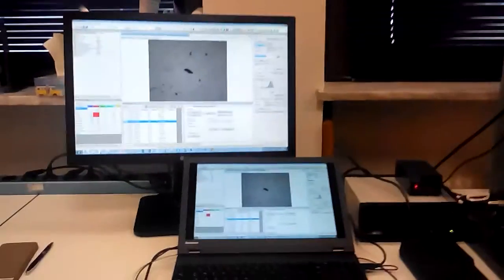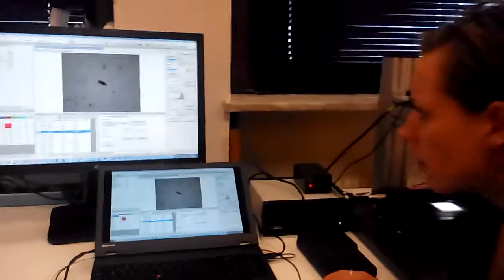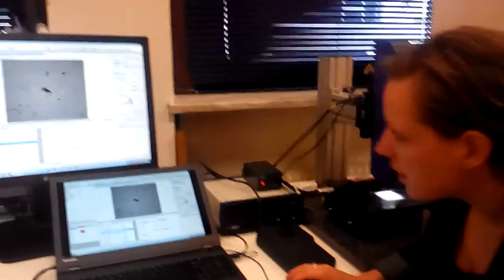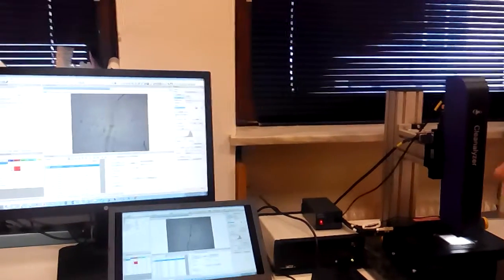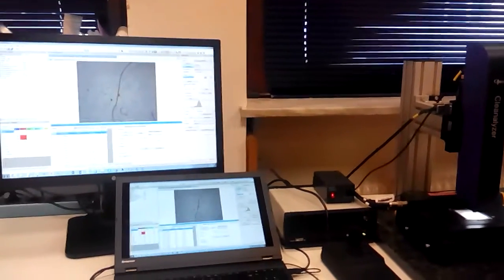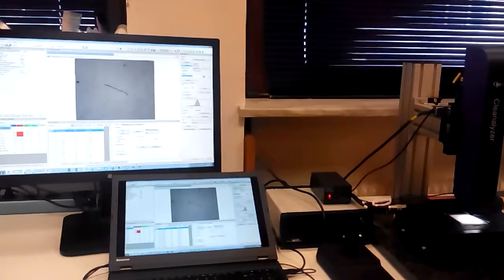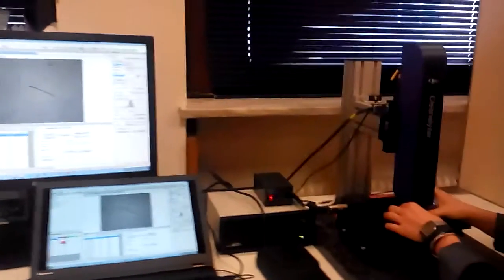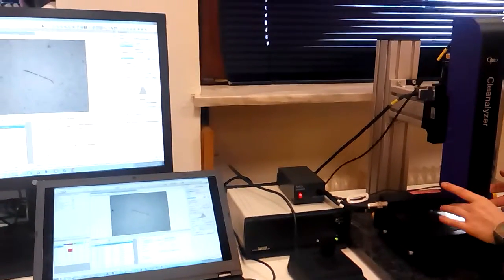Very good. So you can also check, for example, when we say what the software is doing, it's typed as a fiber, for example. So we can check if the particle is a fiber. When we go there to the biggest one, you can see, okay, it is. You can also see if it is reflecting or not. No, it isn't.